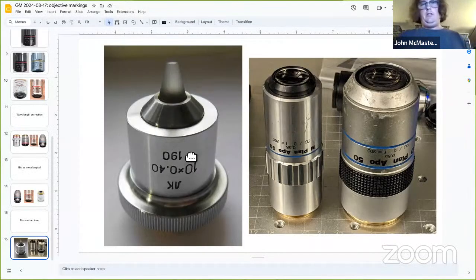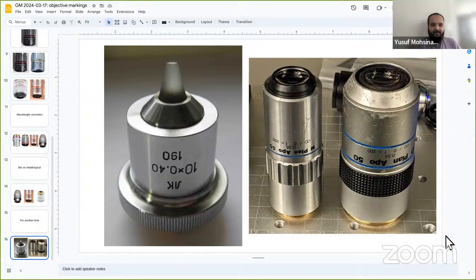Cool. Yeah, so if that's good, I will add one final teaser. I'm going to put this back up real quick. So hopefully you can see these few weird objectives that are left here. So I think maybe for another time, we will talk about some of the more advanced objective modes, illumination styles and stuff. So a little teaser.